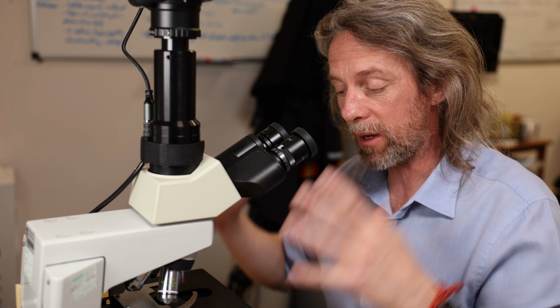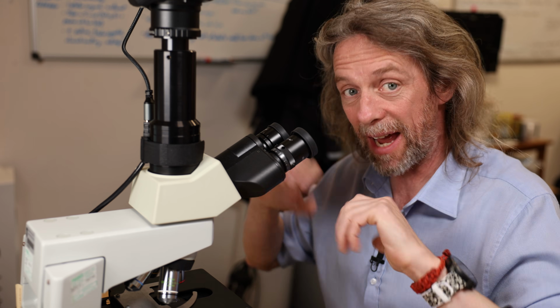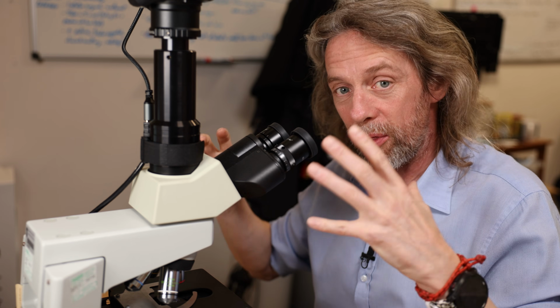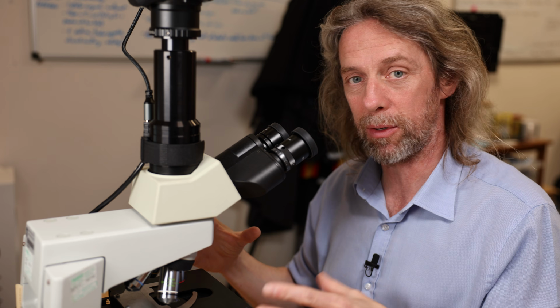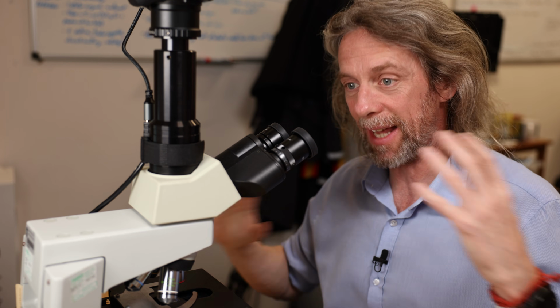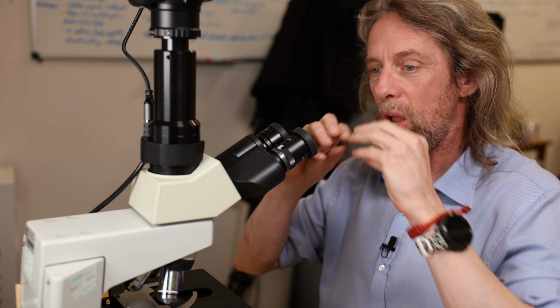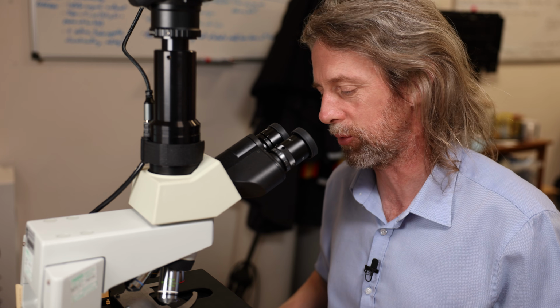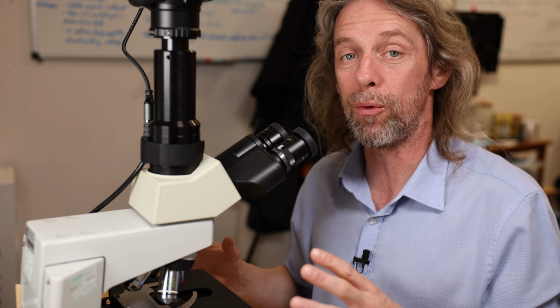I think if we look at the cellular organizations, how the cells were arranged, how the tissues were arranged, and show you what this really looks like on a microscopic scale, then it's easier to understand what a nerve really is, what neurons are actually doing, what we mean when we say ganglia or nucleus and that sort of thing. So we're just going to look at peripheral nerves today.